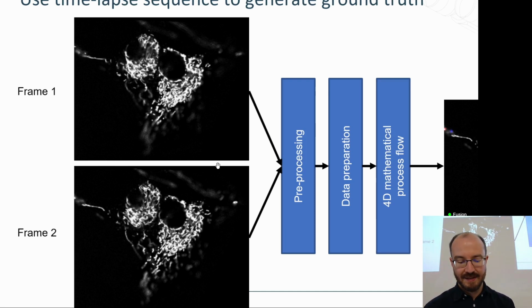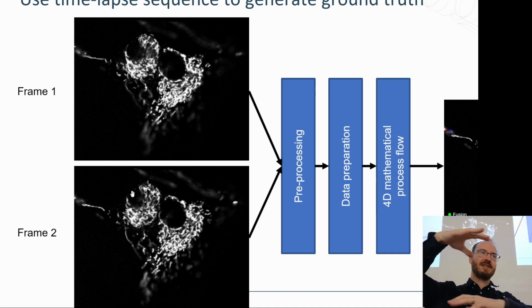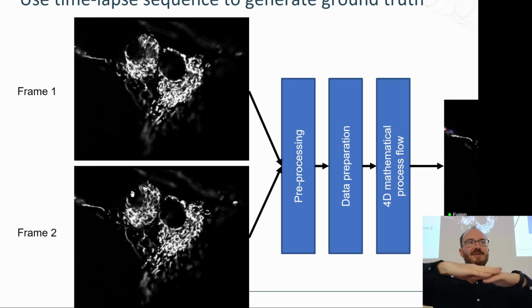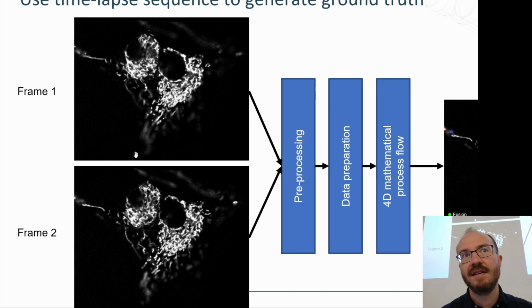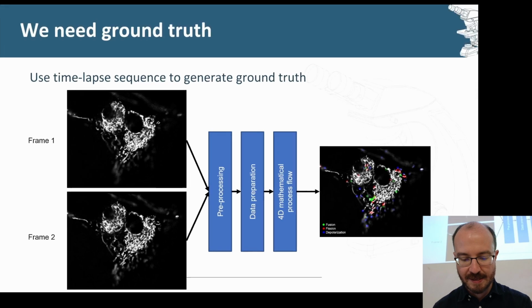Okay. So do you do it in 3D? Yes, you kind of want to do everything in 3D because it's very possible that I've got two mitochondrial structures that are just moving past each other. They never fused, but if I looked at it in 2D, it's going to be, oh, cool, they fused. Could we apply co-localization for that? No, not so much. Localization is usually between two different stains, two different structures. So for this, it's just mitochondria. So not so much for this one.